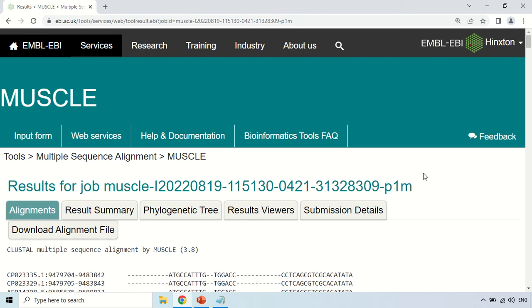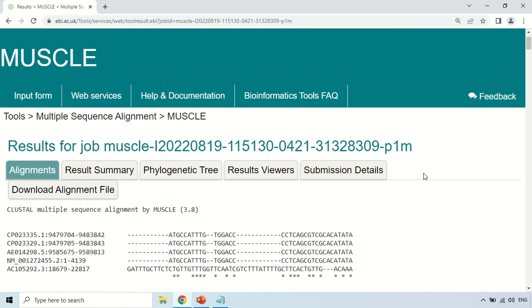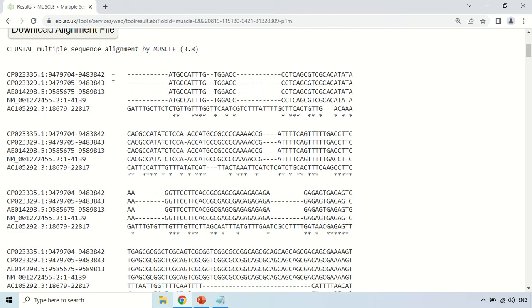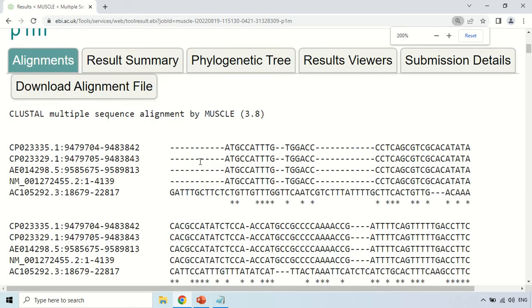How to interpret these results? There are certain tabs like Alignment, Result Summary, and Phylogenetic Tree. First I will discuss the Alignment tab. Under this section, this is the multiple sequence alignment of your sequences. I used five sequences, so these are the five sequences. I am zooming in so it will be more clear. These are the five sequences: sequence 1, 2, 3, 4, and 5.